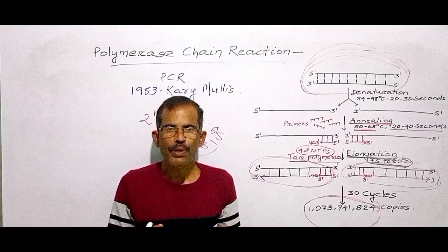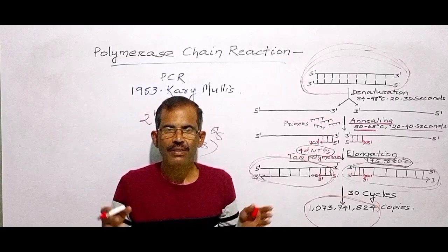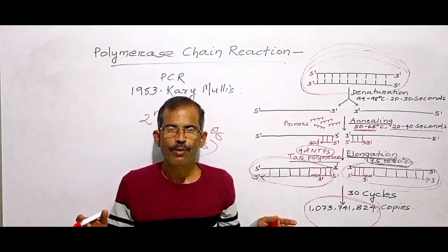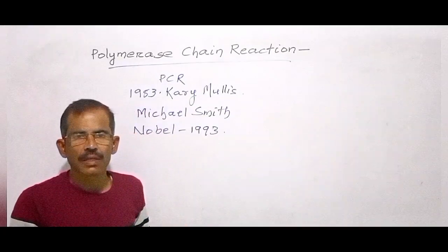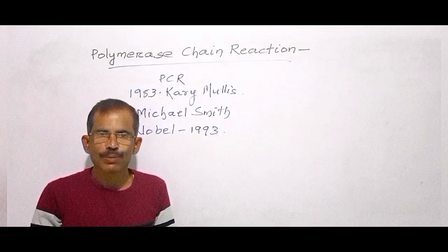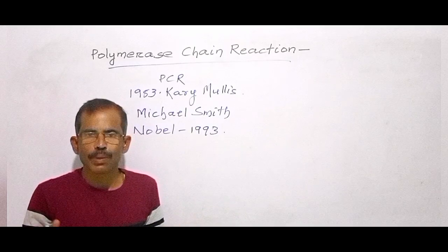Polymerase chain reaction that amplifies specific DNA sequences in vitro by using a series of temperature cycles, and then analyzes the amplified products, known as amplicons, using methods like gel electrophoresis, is known as standard or conventional polymerase chain reaction. By this technique, copies of a very small amount of DNA sequence are exponentially amplified in a series of cycles of temperature change.